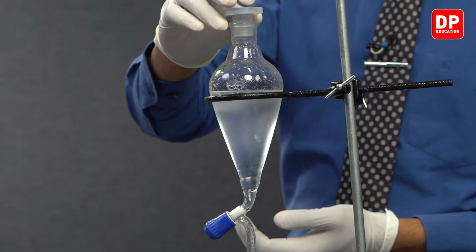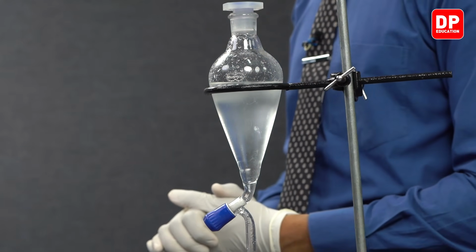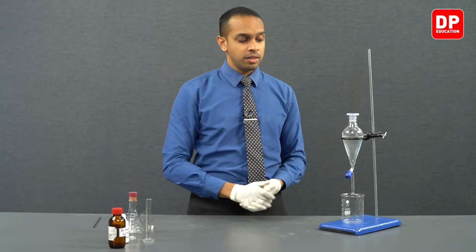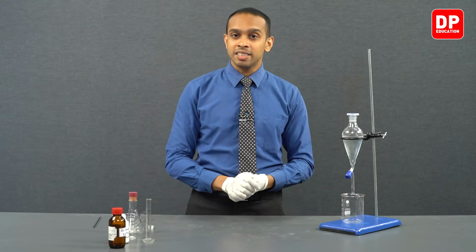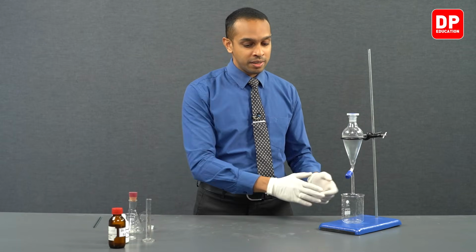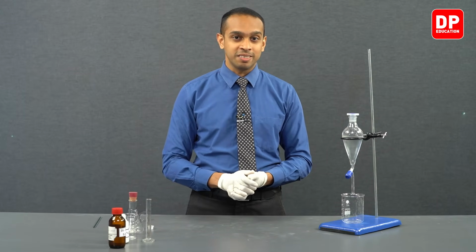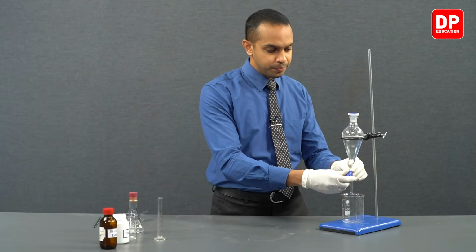And after it separates into two layers, we can proceed to separate the two layers out with the use of our stopcock that we have over here. So we will allow this mixture to separate out into two layers, and then we can proceed to separate out the aqueous layer into this beaker and the diethyl ether layer into our Erlenmeyer flask we have here. Now we will proceed to separate the aqueous layer.